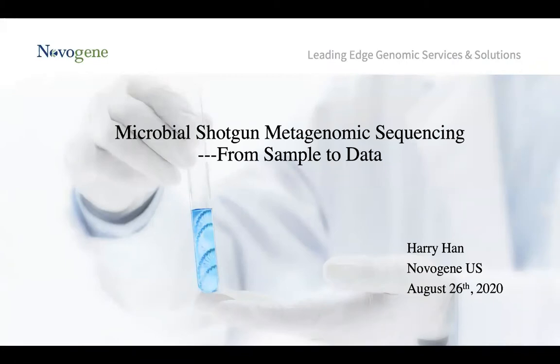And the topic of today's webinar is microbial shotgun metagenomic sequencing, and I will walk you through the entire pipeline of a typical metagenomic approach for your research. That is from how to prepare samples to the popular content of the data analysis nowadays.